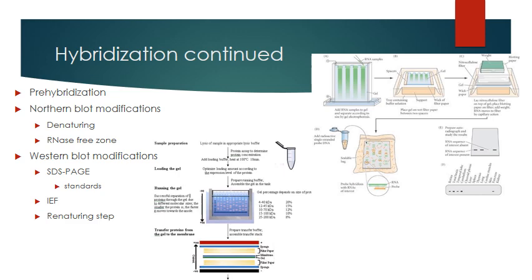In DNA electrophoresis, we very commonly use RNase to eliminate any free RNA that might get in the way. Well, if you do that when you're doing northern blot, there goes your whole target. RNase works very well, and it'll ruin your results. So in an RNA environment, one of the things that we frequently use is formaldehyde.